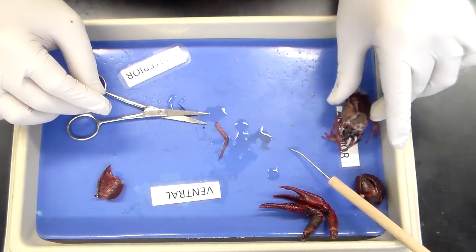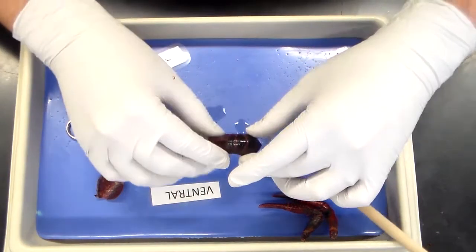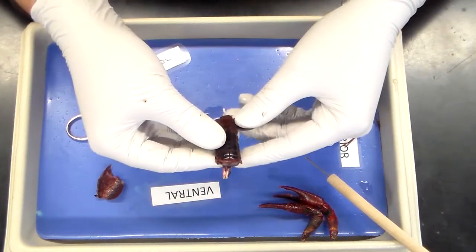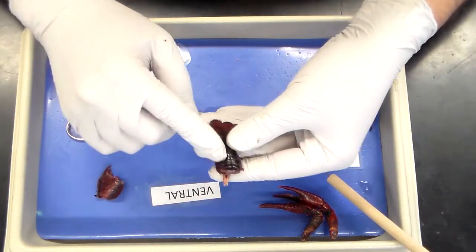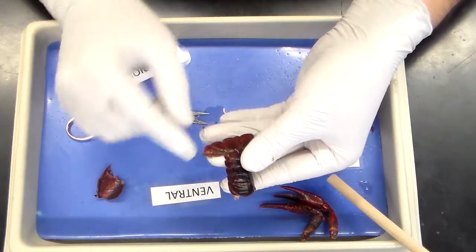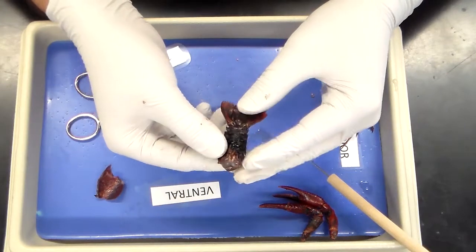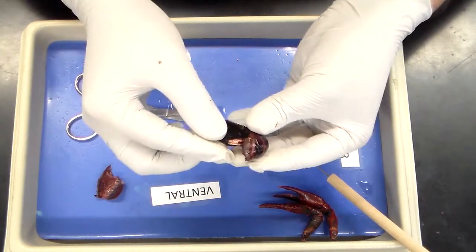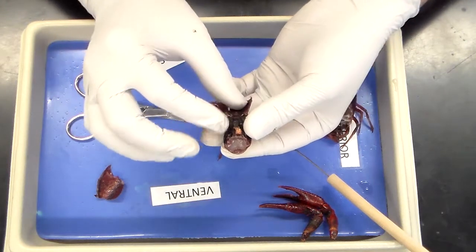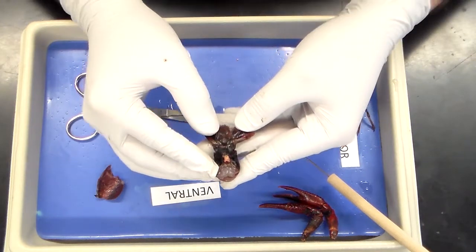We'll set the gill aside and bring back the abdomen that we had set aside from earlier. Notice the abdomen is segmented — again, external structures that you should know: the telson, the uropods. These are what the modified swimmerets look like. They're very tough, and again, that symbolizes this is a male. We'll also notice the swimmerets and the anus.